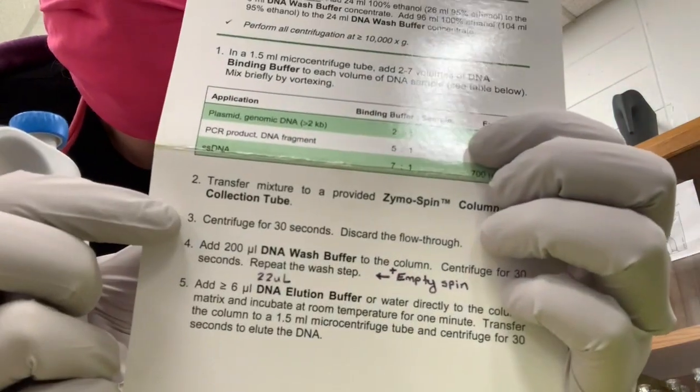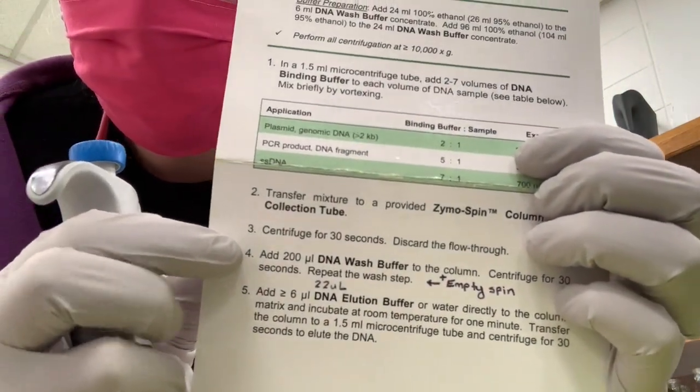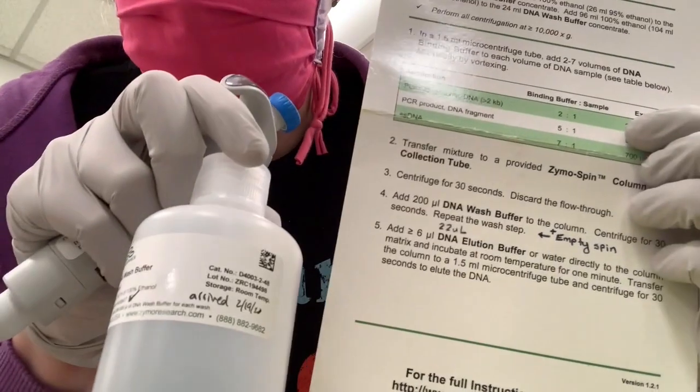So the next part of this protocol, after discard the flow through, is to add 200 microliters of DNA wash buffer, which is our second buffer.